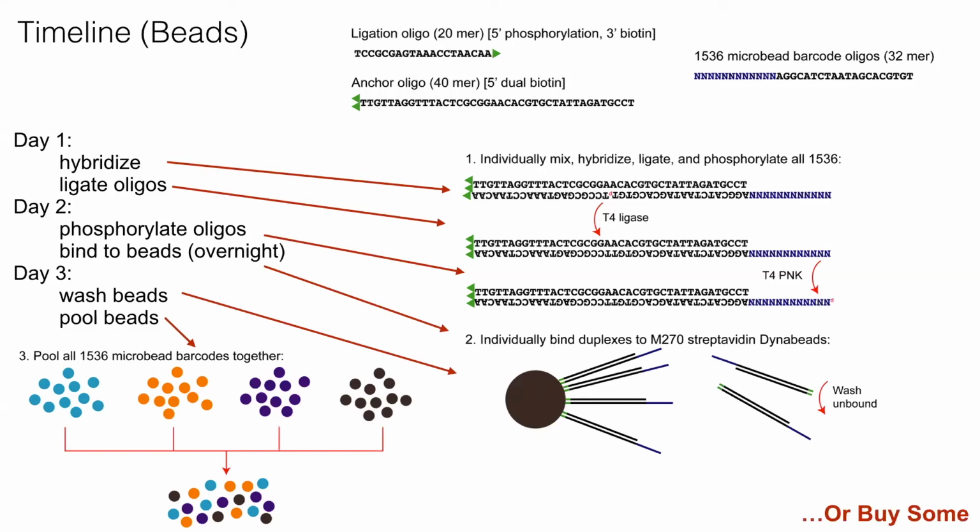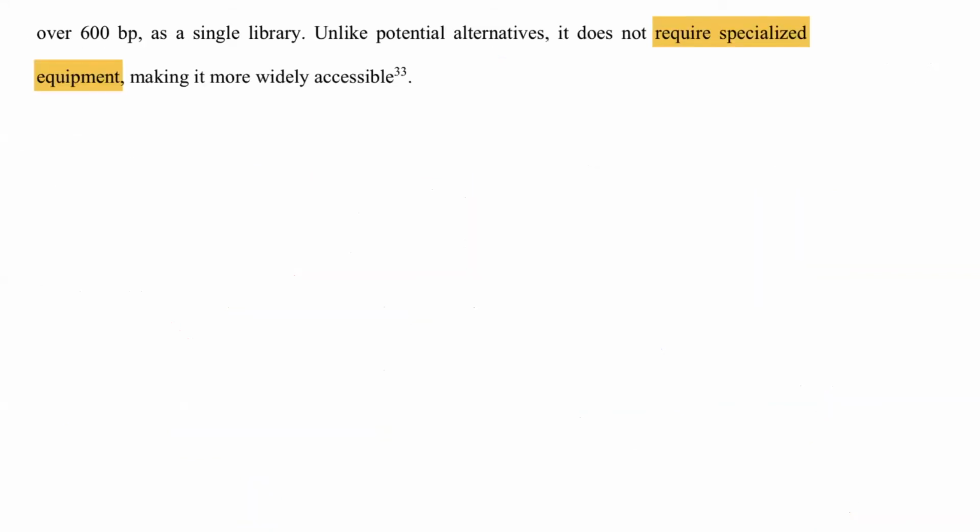Or buy some. So if you're interested in actually doing this, contact me, because I'm trying to get something together where I can probably, through the core at University of Oregon, sell some of these beads, since they're primarily the largest activation barrier towards people actually using this technique at the moment. Or if you know companies that are interested in actually making those barcoded beads, I'd love to hear about them.